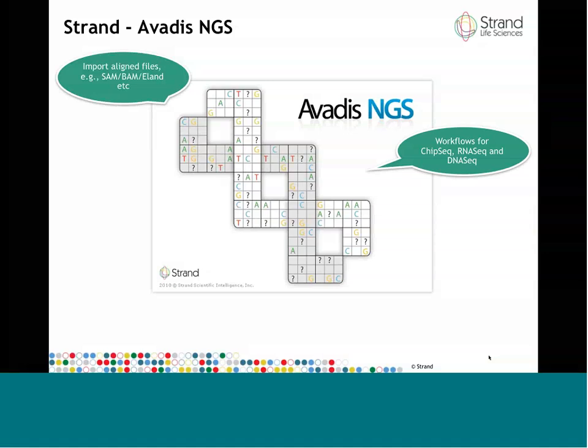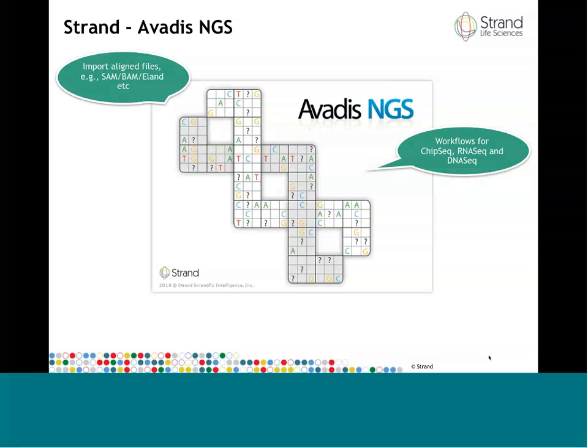It's very likely that wherever you got the sequencing done, the sequencing providers will probably already give you the service of aligning these reads against the genome of your choice, and will give you aligned reads in one of the formats listed here: SAM, BAM, or ELAND, Illumina ELAND text format. So you can take any of these files and import them directly into Avadis NGS. And you can run workflows for ChIP-seq, RNA-Seq, and DNA-Seq. Of course, the focus of the rest of this presentation is going to be on the RNA-Seq workflow.